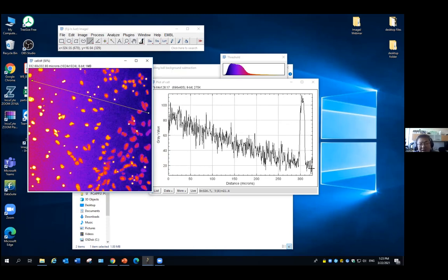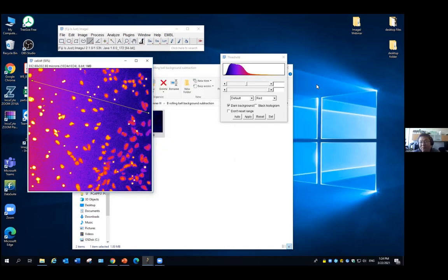It's unlikely this is actually from the sample. It's most likely that you have a problem with the illumination on the microscope. It's just the way you put the excitation light on the sample. The left side has much stronger light than the right side. So it's actually not very uncommon, really. People say it a lot: all microscopes need continuous tuning up and alignment. No system can be perfect for a very long time.